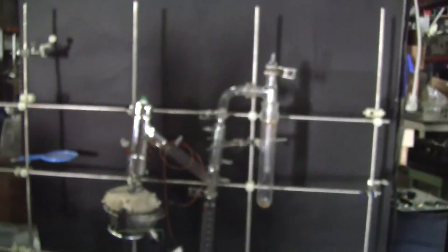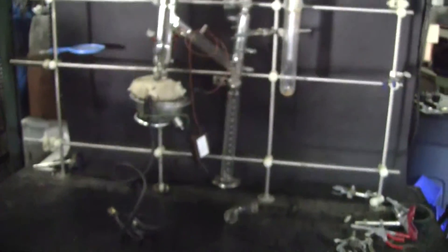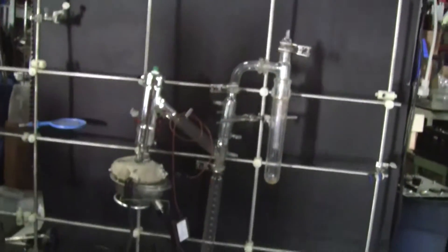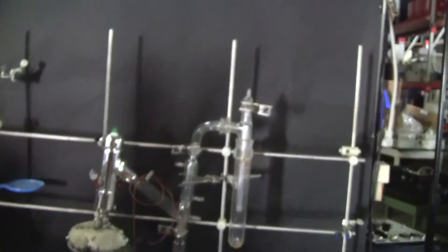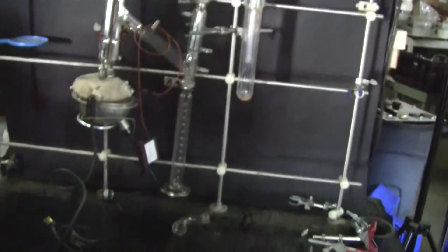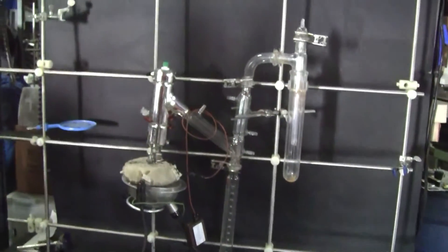Hi, this is Jim from Hi-Tech Trader. We're looking at the vacuum distillation apparatus. We're going to break it all down and show details on each piece of glass to show you that there's no problem with the glassware. See you in a minute.